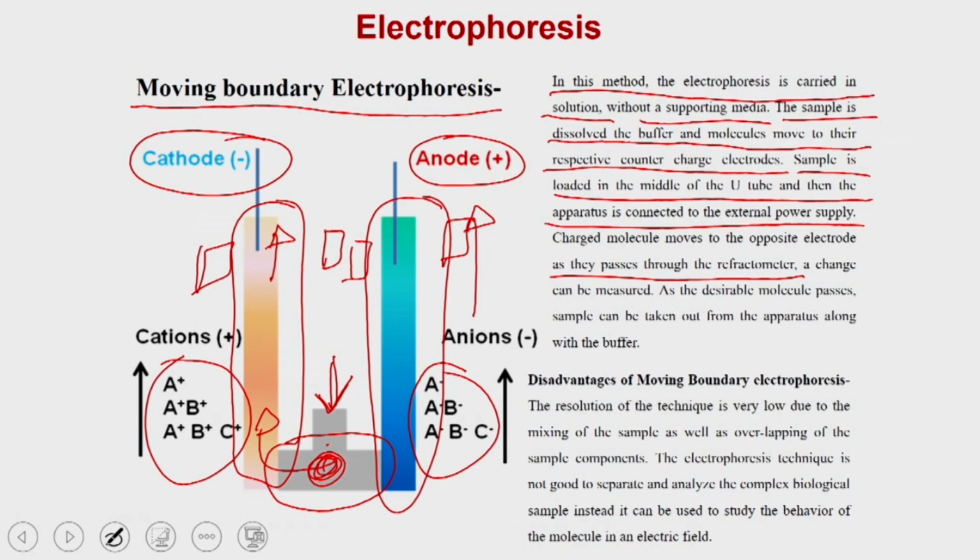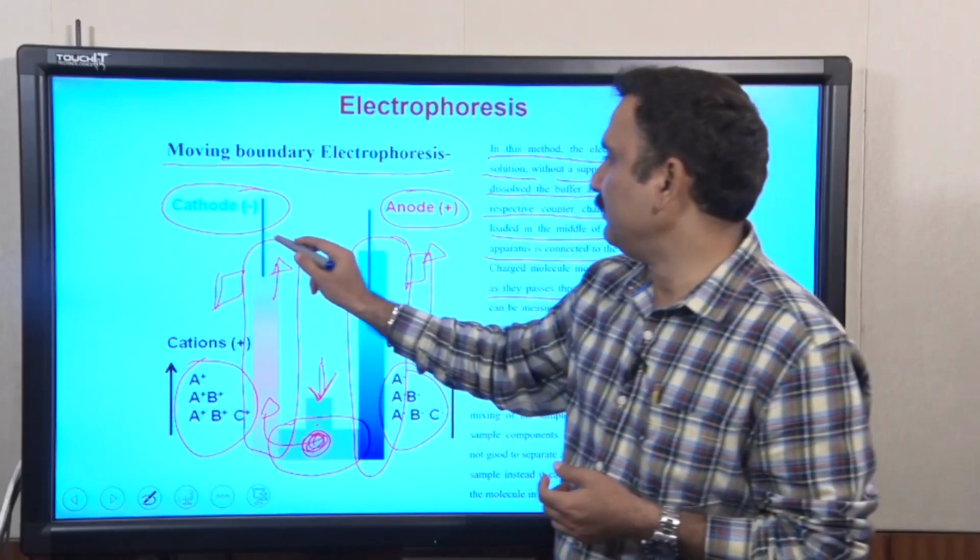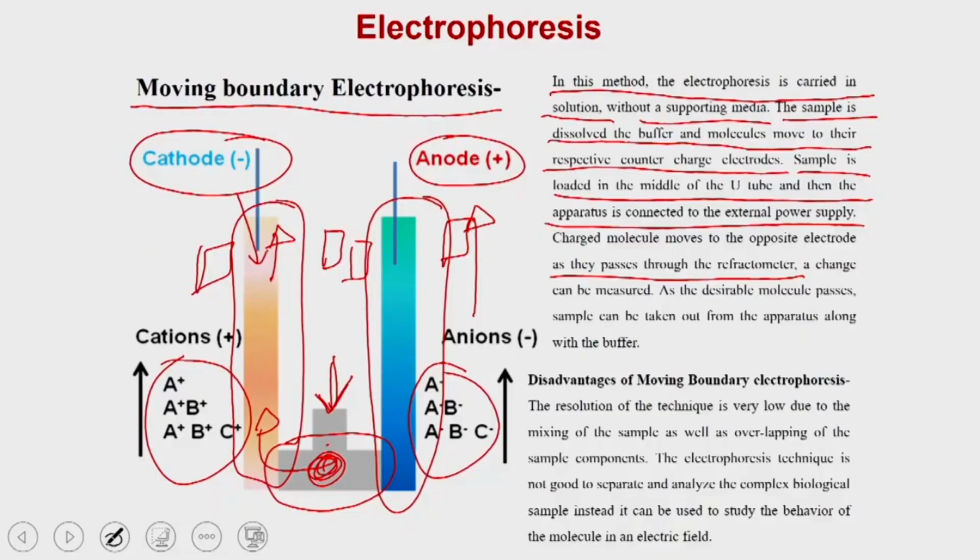Once you see that, you can put in a pipette and take out this particular molecule.